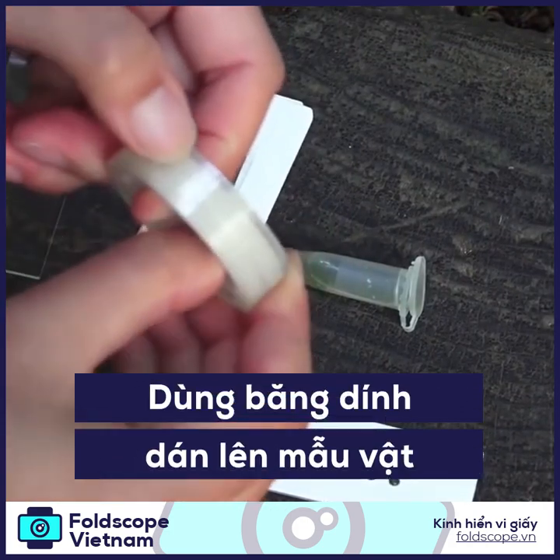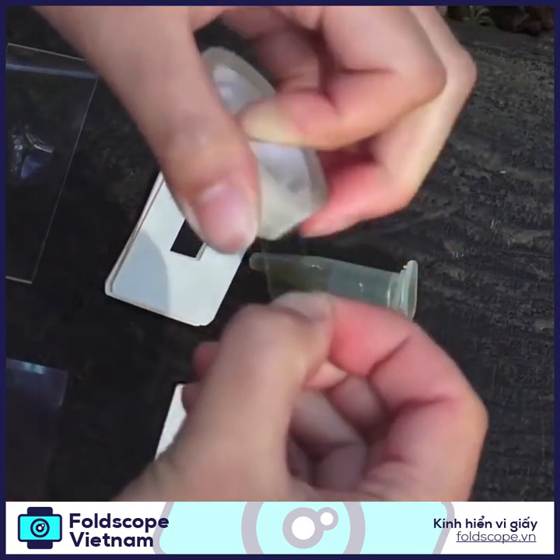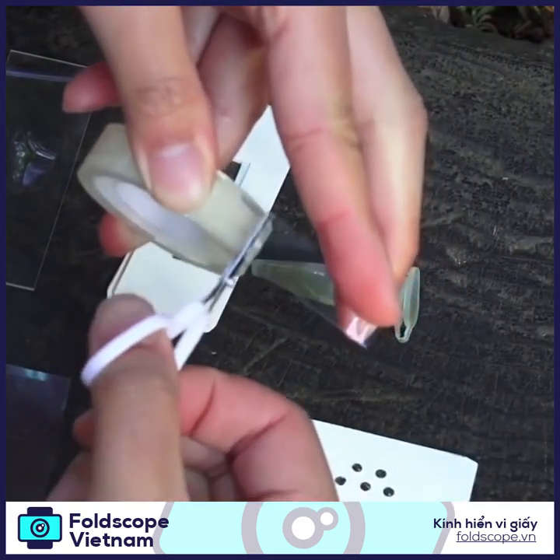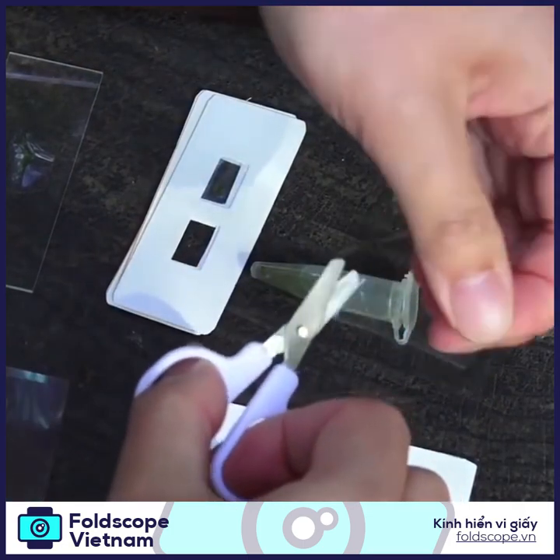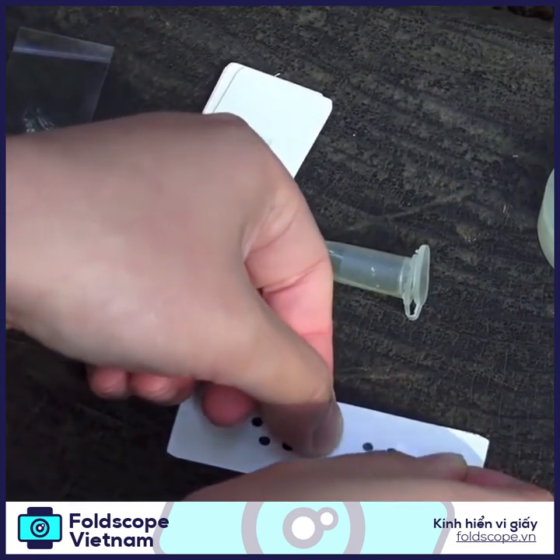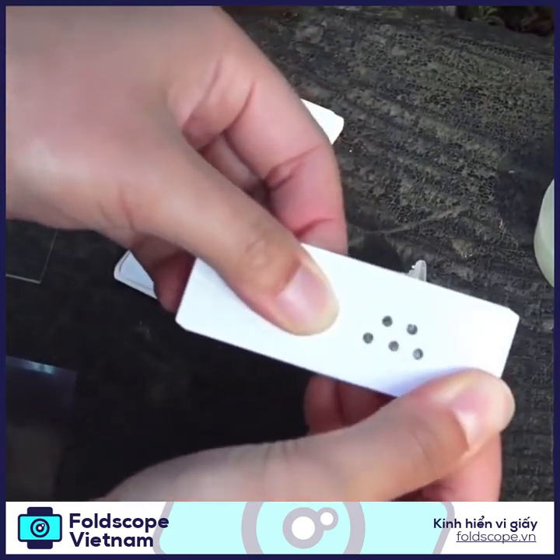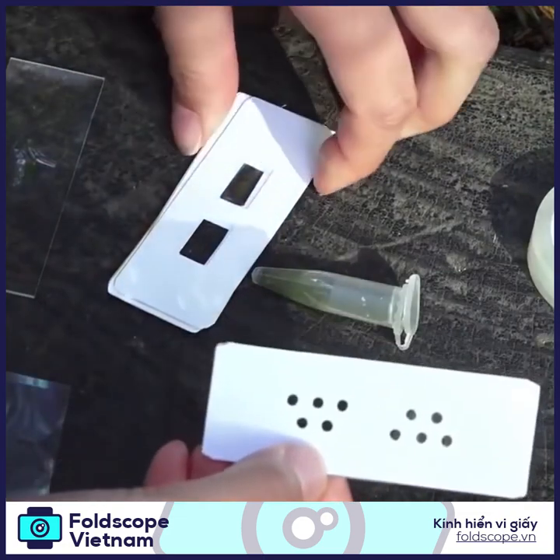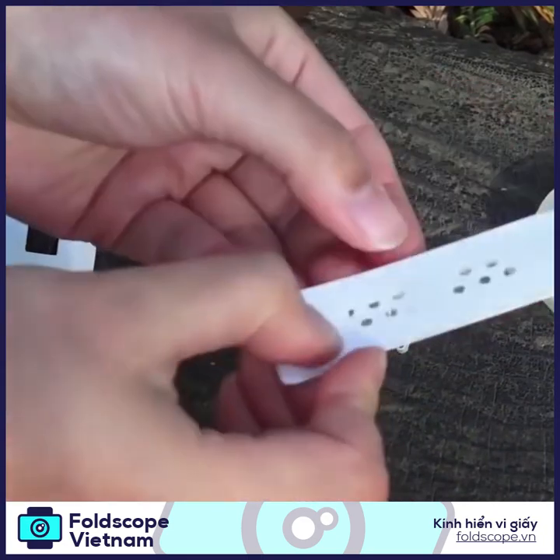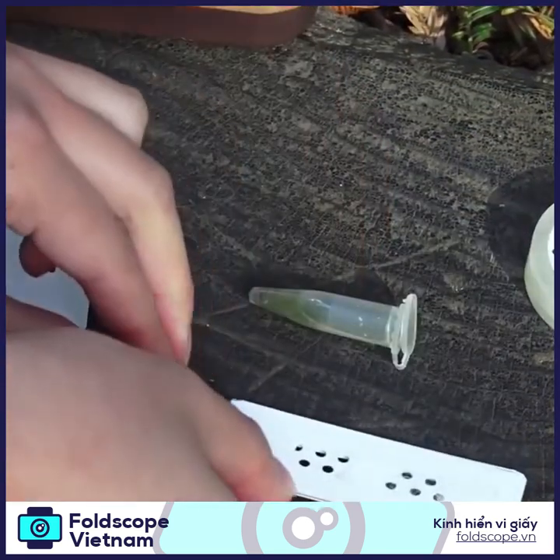Then take another strip of tape and place it on top so that you're sandwiching the water sample with two pieces of tape. Again, you can stack this on top of two empty slides so that the width is the same as the glass slide.